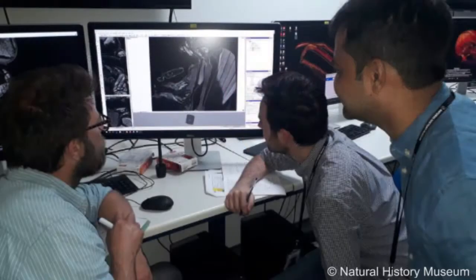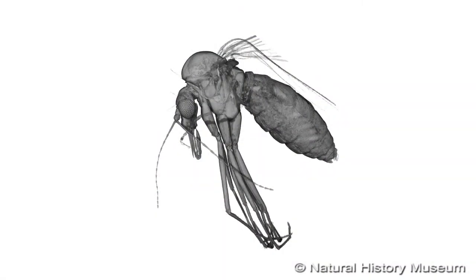My name's Martin Hall. I'm a research entomologist at the Natural History Museum in London, based in the Parasites and Vectors division of our Department of Life Sciences. So what we're hoping to do in this Gnatwork project is to visualize the host-parasite interface in our vectors. This work stems from our previous work over the last few years using micro-CT scanning to visualize morphology of insects.